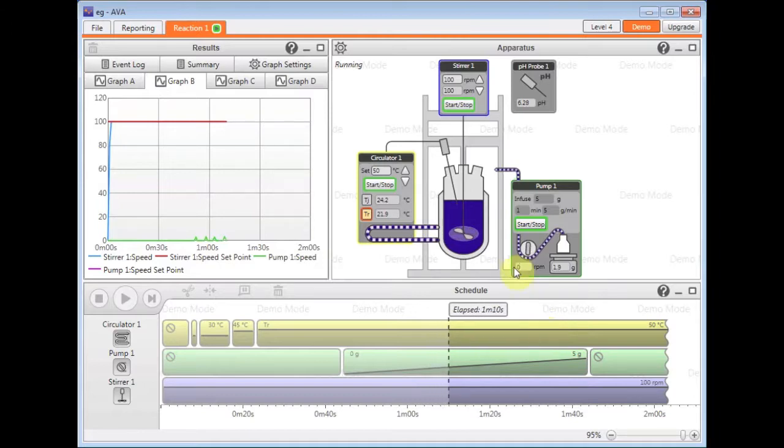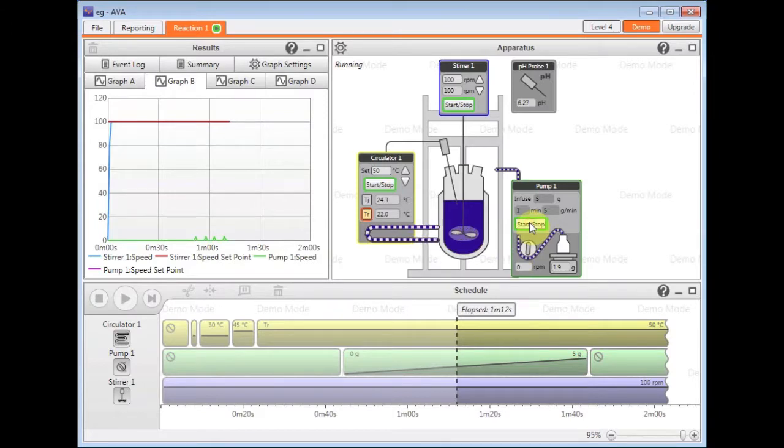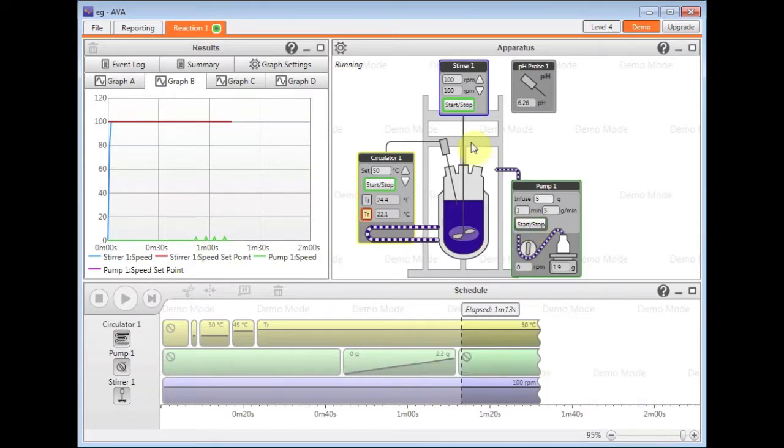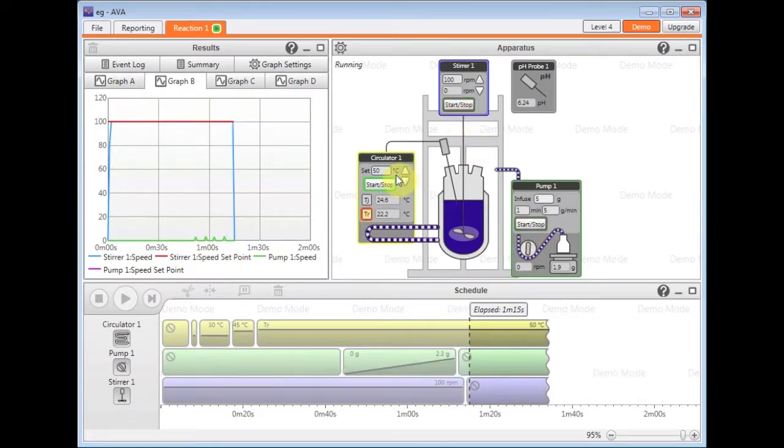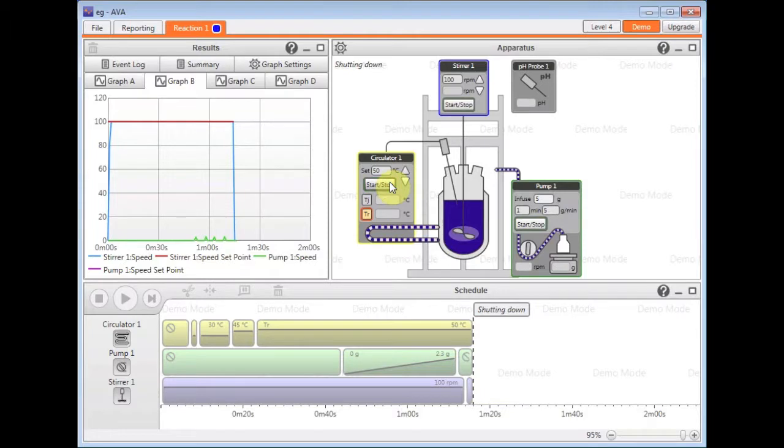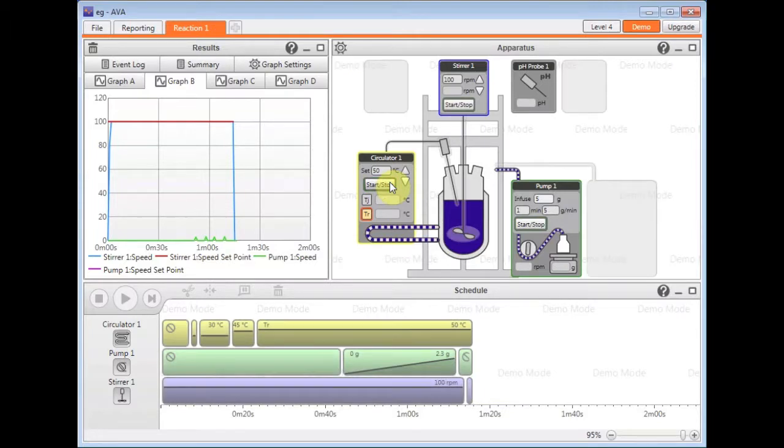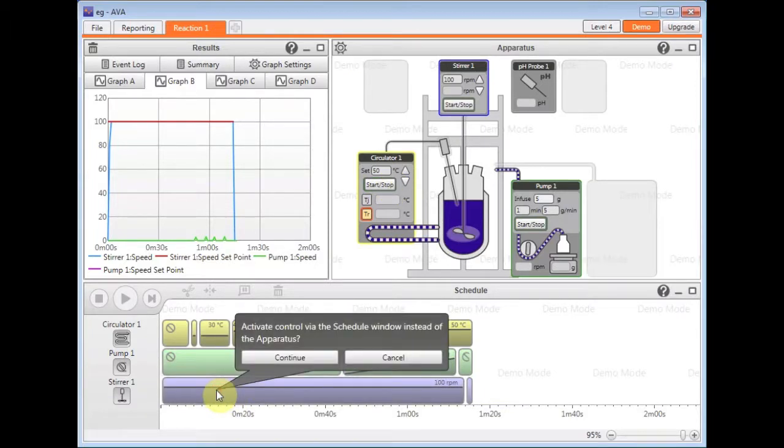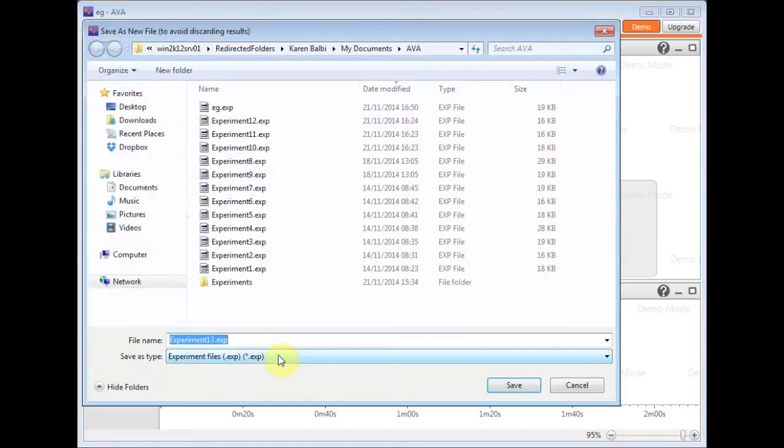Just to show you an example of that, if I just stop the apparatus running in this window and then click on this area down here on any of the rows, I can activate control via the schedule window instead of the apparatus by clicking continue.